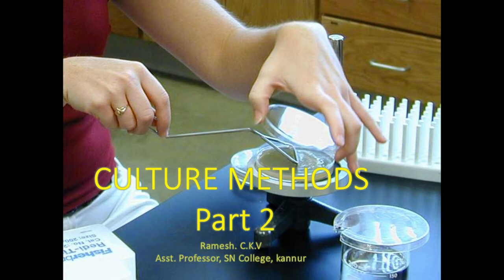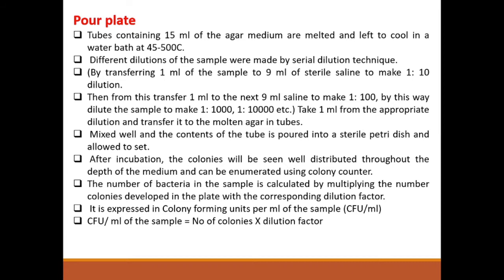In this video we will discuss another two culture methods, PourPlate culture method and SpreadPlate culture method. PourPlate culture method. Here PourPlate culture method is mainly employed for enumeration purpose.